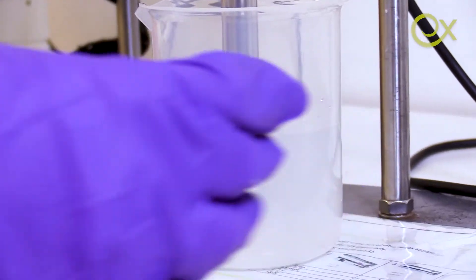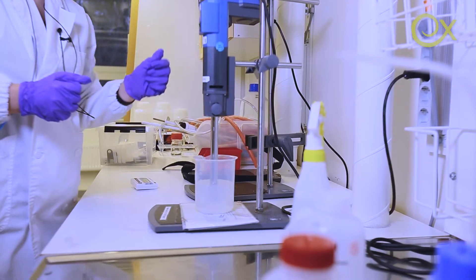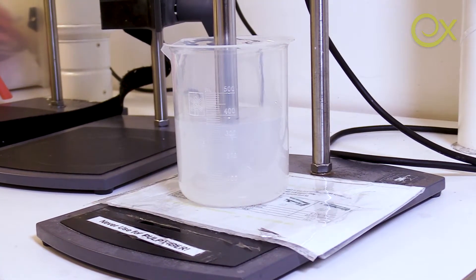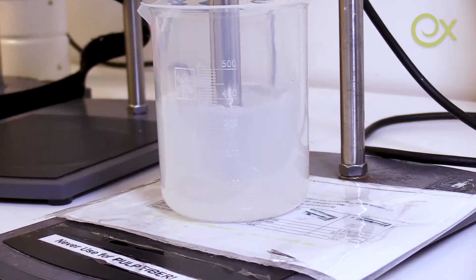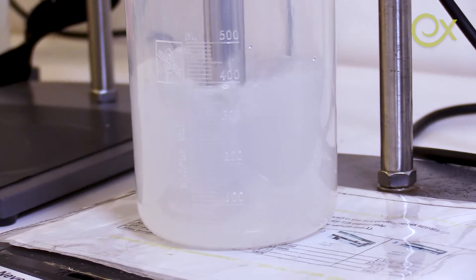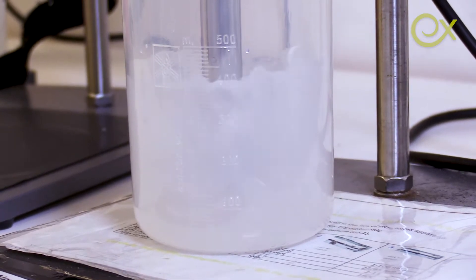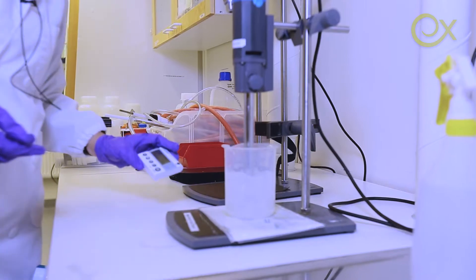Today we are going to try the KTH conditions, which are 12,500 rpm for 10 minutes. I'm going to adjust the speed step by step. I start the timer and let it run.